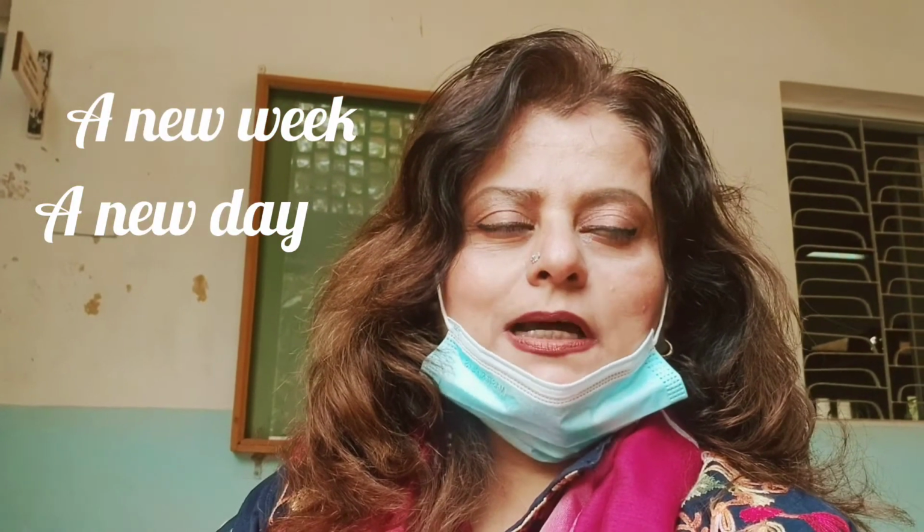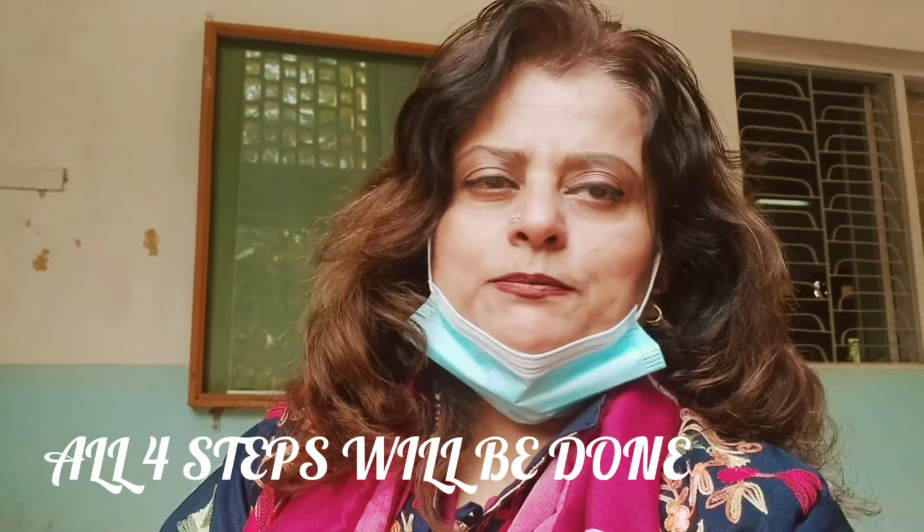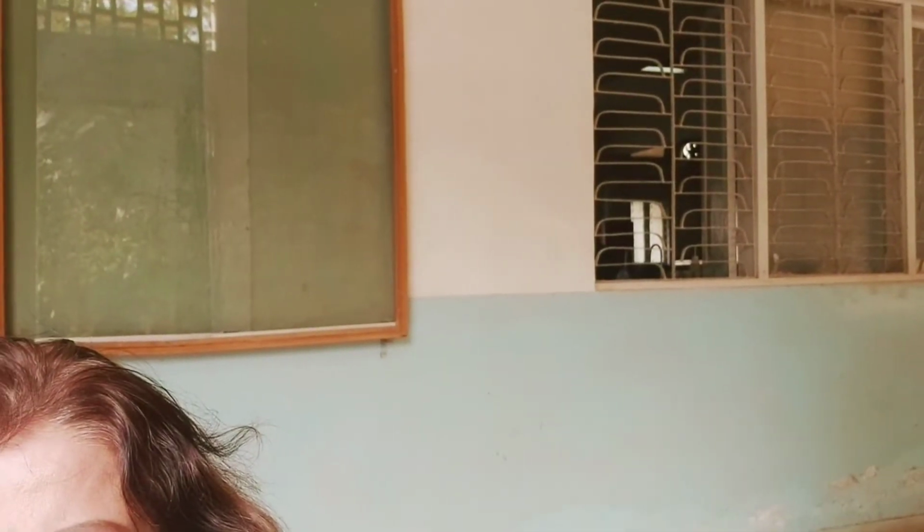Today my students are going to analyze an unknown organic compound. They have been provided only a whitish powder, and with the help of that powder they can start analyzing it by going through a series of steps: step number 1, step number 2, step number 3, and step number 4. All 4 steps they are going to do in the lab. You can see them in the window, and they are performing step number 1 right now.